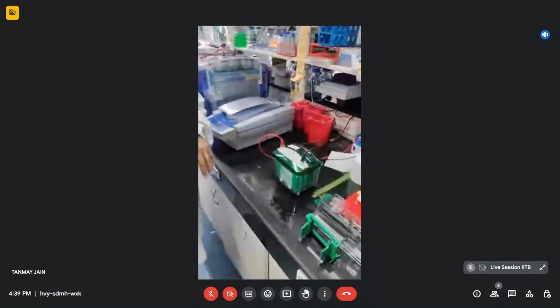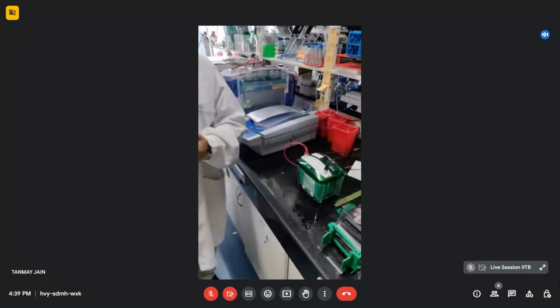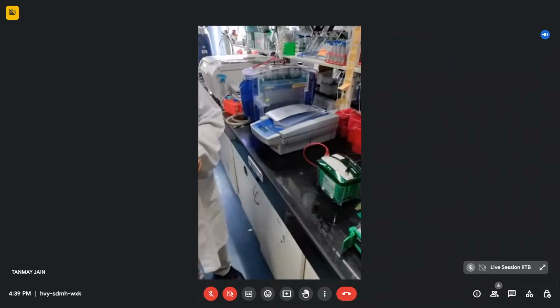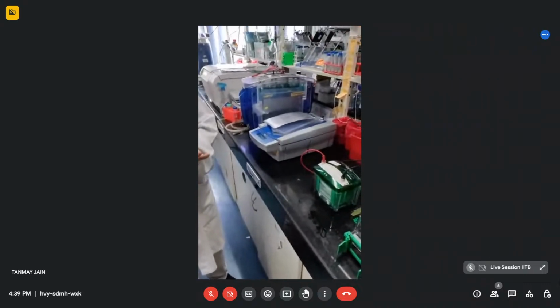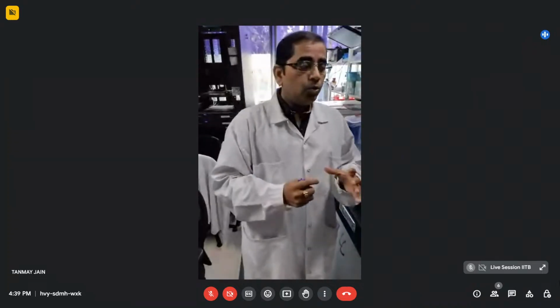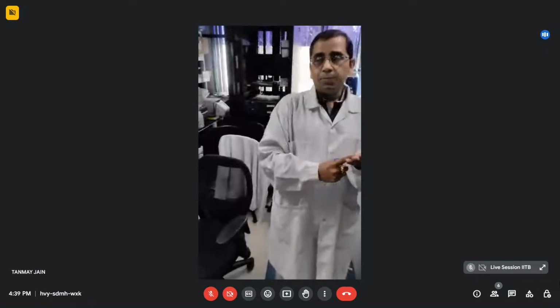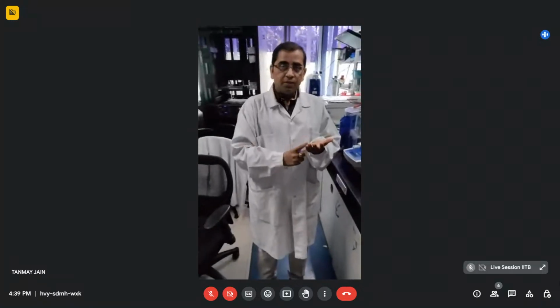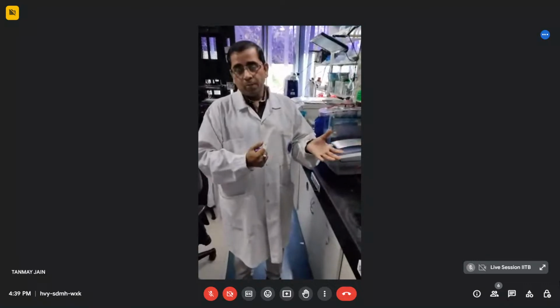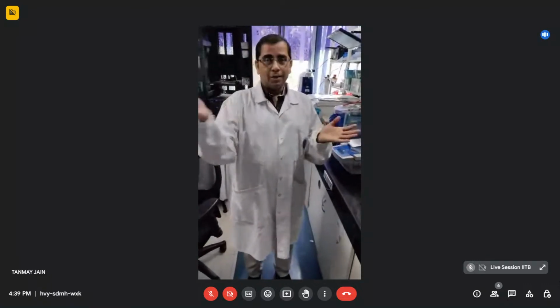Likewise, you can use SDS-PAGE, chop down the gel pieces and cut those to separate the fractions, and then run them on the mass spec separately to generate more coverage. So these are the different ways when you are looking at how to extract the protein, how to do the qualitative check, quantitative check, and resolve the complex mixture, right? But then the next step will be, you got these bands or you got protein in solution form. How are you going to run them on the mass spec?